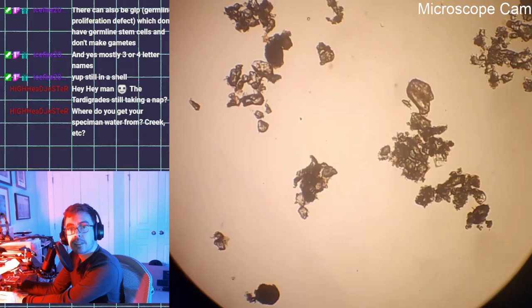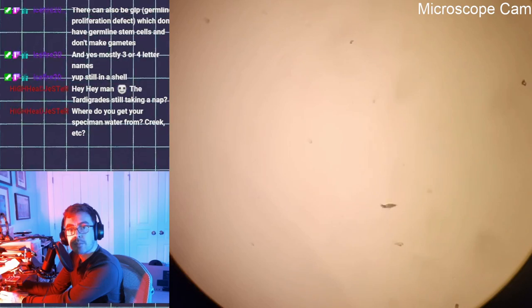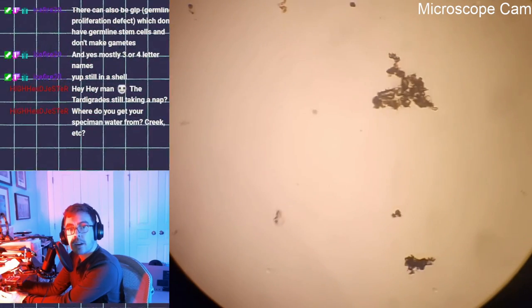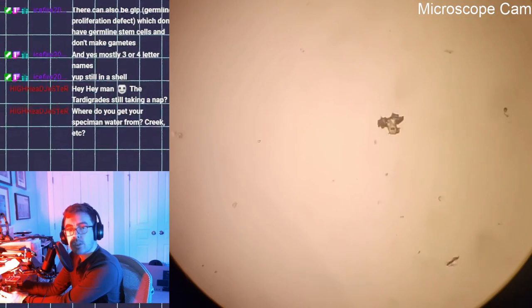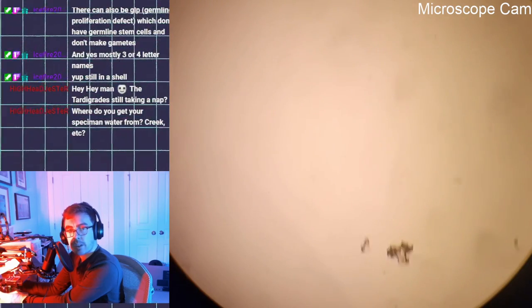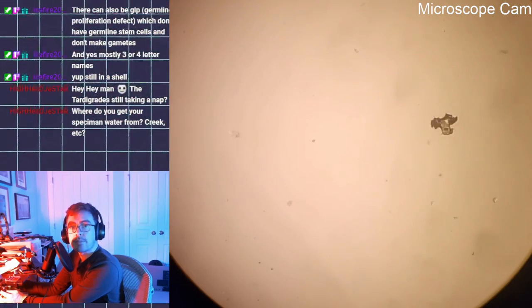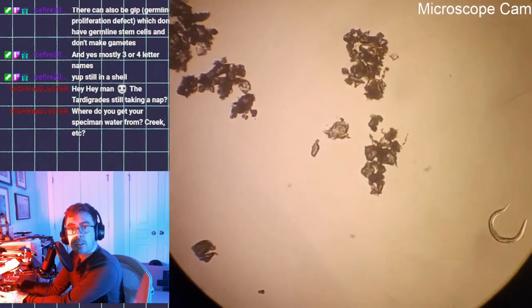They're pretty slow before. And now they're all riled up because I moved them. Maybe. They don't know what's going on. Yeah, so lakes are pretty great, especially by the shoreline. I've actually tried to take samples from creeks or small rivers, streams before. They're actually not too great. I think the movement of the water kind of discourages a lot of the more fun things from growing, or I just didn't know where to take from. All right. Come on, you. I'm getting a little sick of following you around.